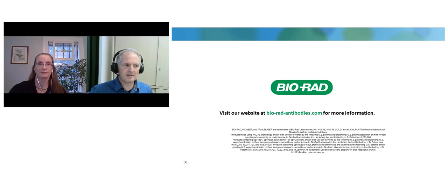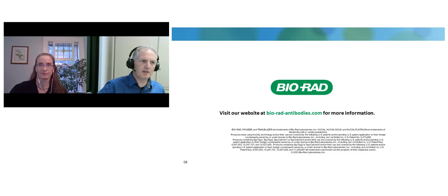So one thing is that in CysDisplay, the selection system and the protein of interest, the library, are not separated on the phagemid. So you need to subclone the library after selection into an expression vector. It is slower. And you not only get the disulfide bond formed between the Fab and the P3, you also have P3 dimers and Fab dimers, so it is not that easily controllable.